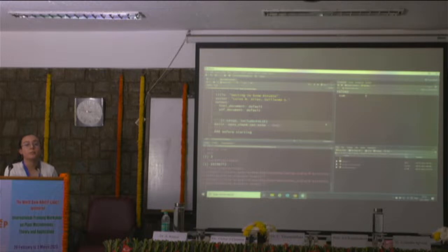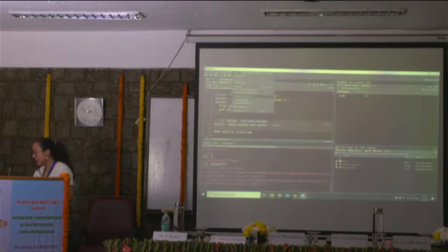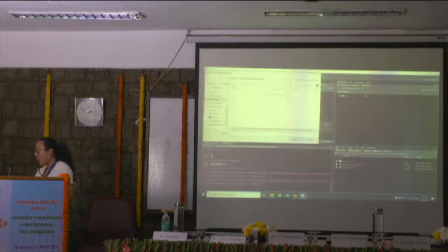Should I do it once more, just so we're clear? Okay, so if you're in your folder, you go session, set working directory, and choose directory. Once you are in, I'm looking for my folder, right? I know it's this one.